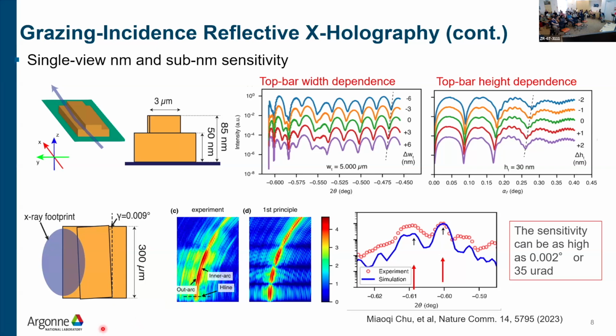The X-ray comes this way. This is experimental data. I cropped the rest of the image and only left this Lloyd mirror effect region. If these two lines were stacked perfectly without any orientation errors, you would expect a single arc, maybe with some higher order fringes along this transverse direction, the first order, second order, third order. That's what you expect. But for this sample, we find there are basically two arcs. It's not clear, but if you change the contrast, you see clearly two arcs.